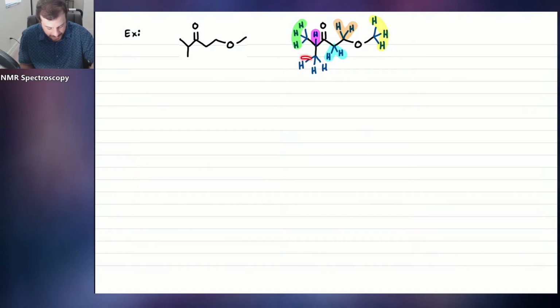So they're always the same in their own group. But the question is, are these protons part of this group or are they different? Well, take a look. By symmetry, this methyl group and this methyl group are freely rotating around this bond. So they can interconvert by rotation. So that means that this methyl group and this methyl group are cut from the same cloth. They're in the exact same chemical environment. So they're all part of the same signal. So they're all on team green.